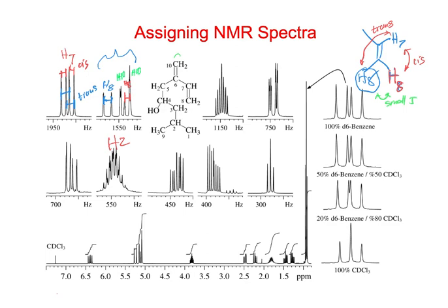You know, so it's not 100%, but I think by matching those other two and then this one here, right, this one's taller than everything else, and that's because it has a component of this one underneath there. So that would be my best guess or proposal. Maybe not a full-on guess.